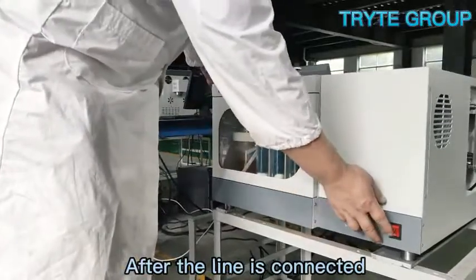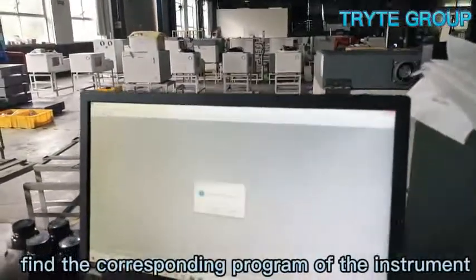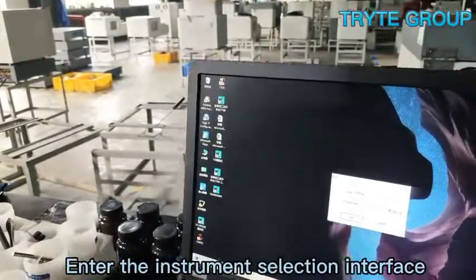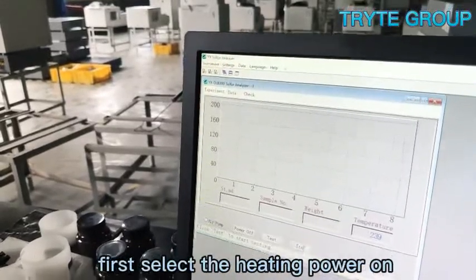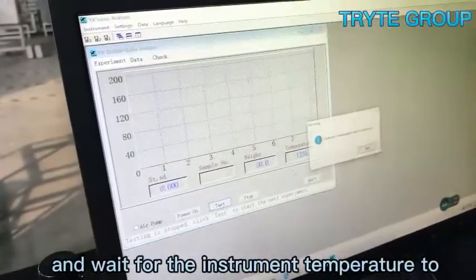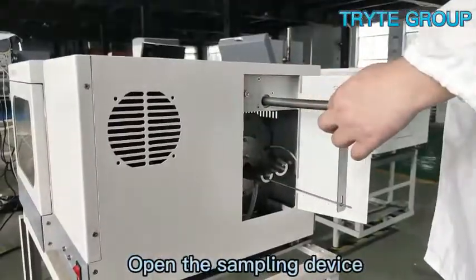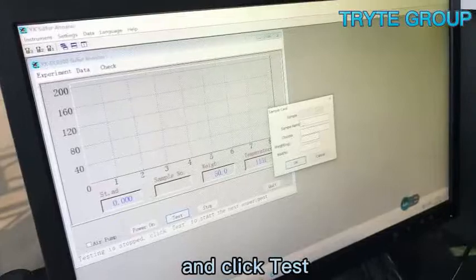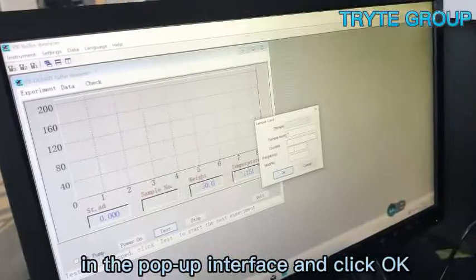After the lines are connected, turn on the power switch, then go to the computer, find the corresponding program for the instrument, enter the instrument selection interface, select the instrument to be used, and open the corresponding interface. First select heating power on to let the instrument start heating. When the temperature reaches above 1150 degrees Celsius, open the sampling device, put the weighed sample crucible into the sampling device, and click test. Enter the sample parameters required in the pop-up interface and click OK.